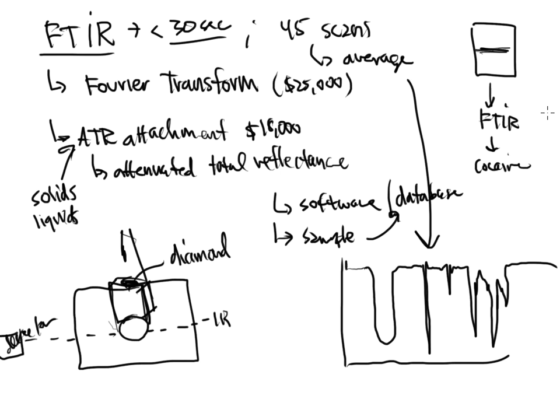Or rather, these are the possibles. Number 1, number 2, number 3, number 4, number 5. And then it will list right beside each name how confident it is about that identification. We are 80% sure it's cocaine. We are maybe 76% sure that it's this, and we are 5% sure that it's powdered sugar. You get the idea. So it is a great way to identify unknowns.